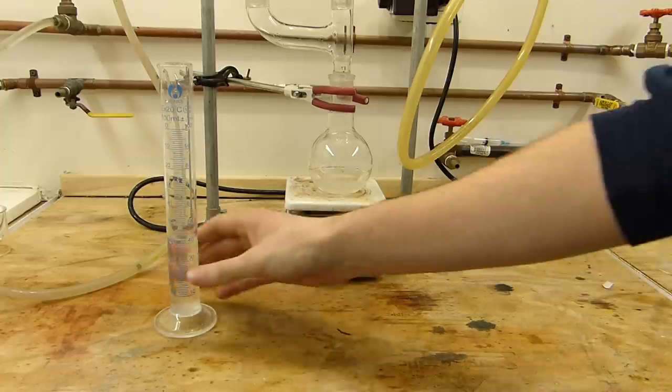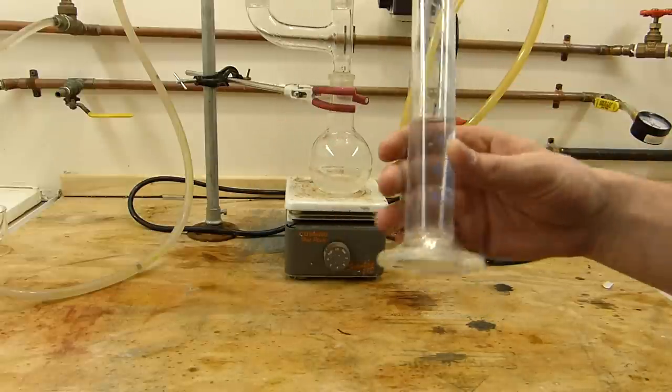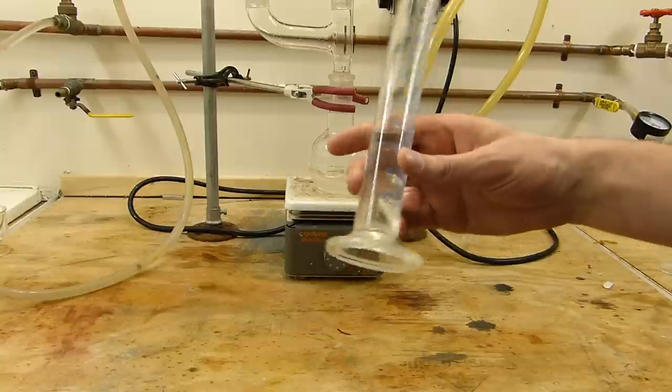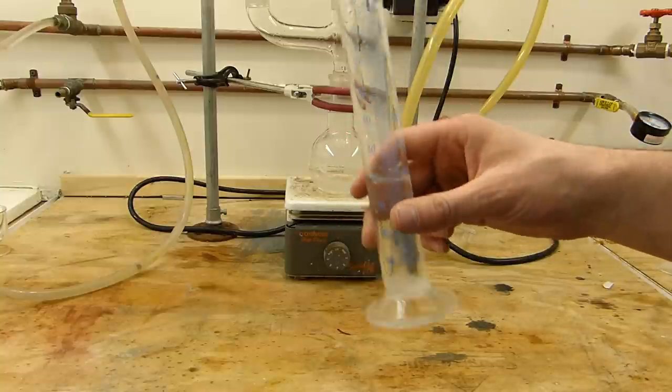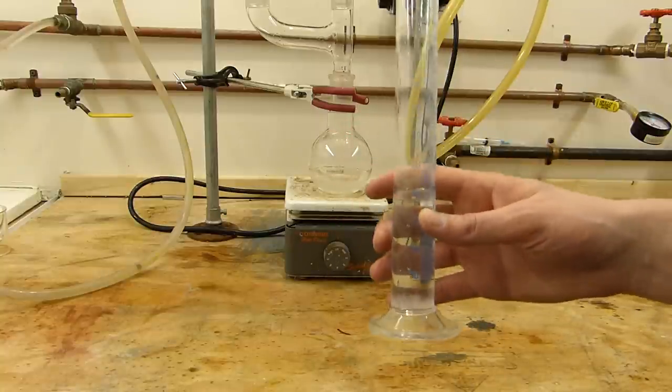So here's our yield. It's approximately just over 40 milliliters of a fairly concentrated solution of ammonia. I could take a specific gravity of this and get a fairly reasonable estimate of the concentration. I could also get it by analysis with, say, titrating a copper salt or something like that.